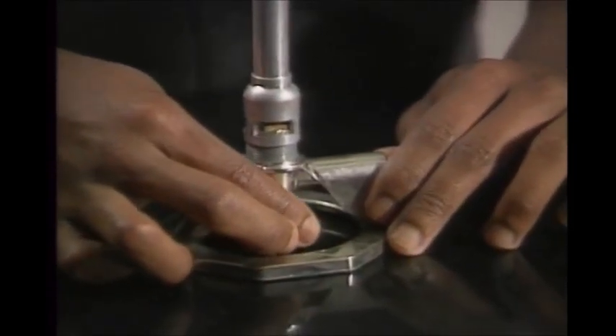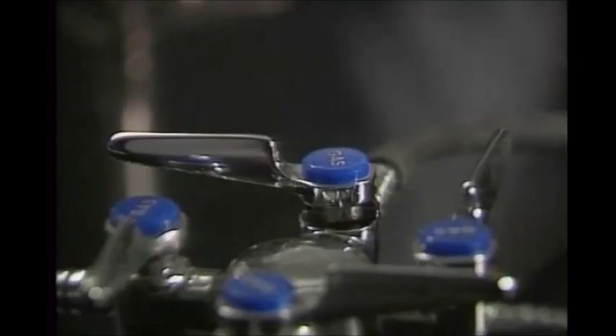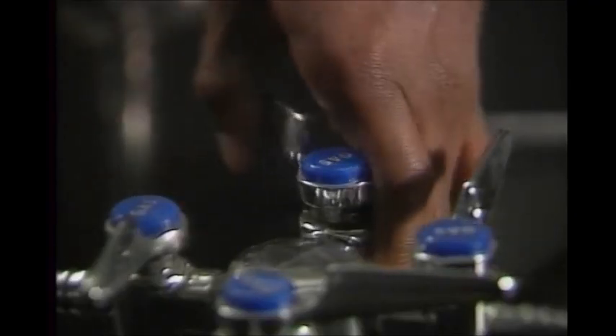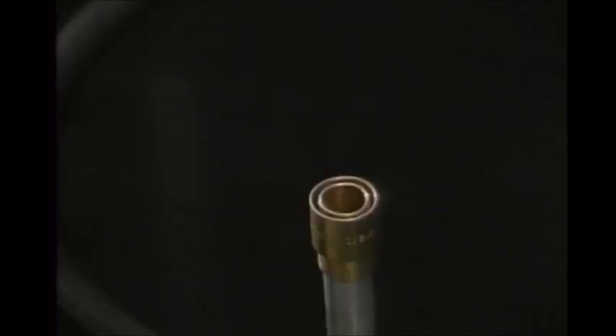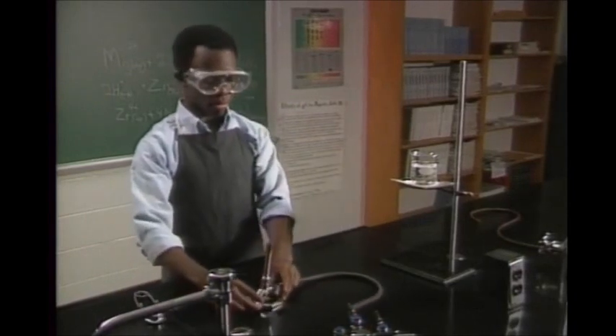You can light a Bunsen burner with a striker or a match. Open the gas line valve and light the burner. If the flame is properly adjusted, you can place the burner under your setup.